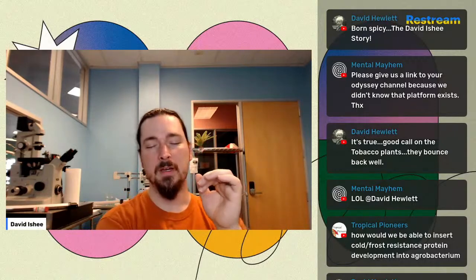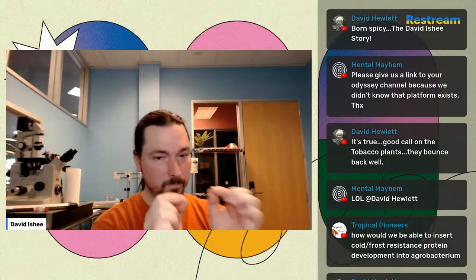So the last two enzymes is what you need to add. So you need to add these two genes. And that's what you're going to do with your genetic modification. The nice thing about agroinfiltration is it's really great for prototyping. At least if it's something that you intend to express in the leaves, which you could always change your promoters, but whatever. If it's something you intend to express or are capable of expressing in the leaves, then you can turn the whole project around really quickly. So instead of spending literally months cloning your thing to see if it worked, you can take the leaf, squirt, wait 3 days later, and test this and see if my modification worked, if it actually does make capsaicin, if it's really a spicy leaf or whatever.